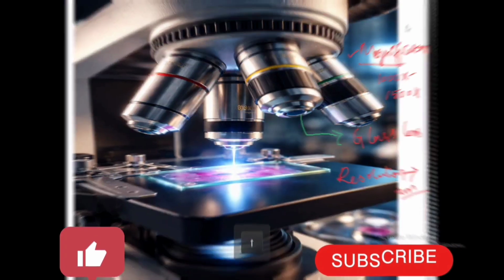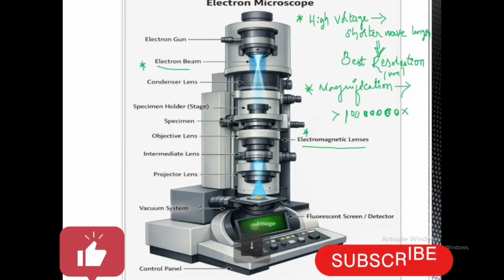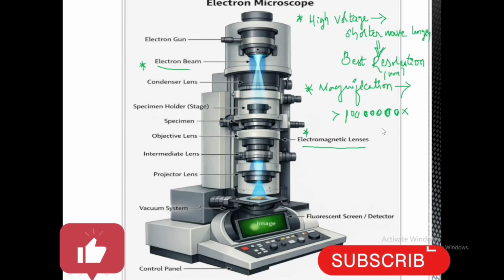Next, the light microscopy magnification power is 1000x to 1500x. In electron microscopy, the magnification is more than 1 million times. The image can be magnified more than 1 million times. Here the different lenses present are the objective lens, intermediate lens and projector lens. These are all electromagnetic lenses, and they are important for magnification of the image.